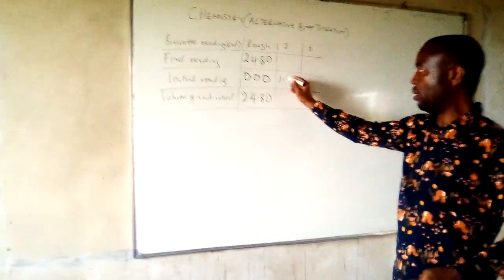So this is E. Add a small amount of acid, check whether the burette is leaking. It is not, so we'll add more. Then remove the funnel and adjust the level of the acid. You may decide to start from one whole number. It must not be from zero again. So I'm going to one, I'm there. This is one whole number. So we'll write initial here as 1.00.